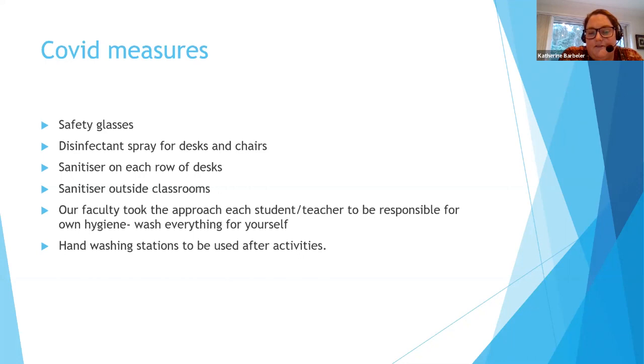In the end, what we've done at our school is teach the students that they're responsible for their own hygiene. So when they use the safety glasses, they get them out of the disinfectant solution and wipe them clean, they wear them and they put them back. Then the next students would clean their own safety glasses. It's been the same with cleaning of their desks and their chairs. We've tried to get each student to be responsible for their own area. We've provided sanitizer, teachers prompt and remind, and that's basically it.